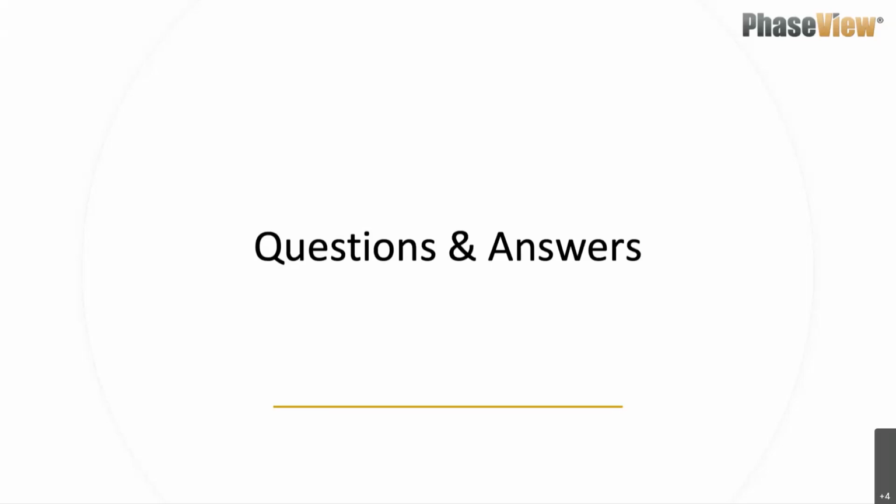Matthew, do you have any other questions that have come into you? Yeah, so one question about roots. I showed a lot of images of aerial organs, and so the question is if it works for roots. And yes, of course, it works for roots. I didn't work on roots because it's not my PhD project, but I did some tests, and yes, of course, it's working for roots.